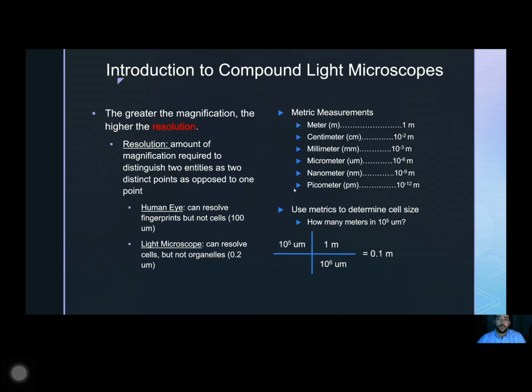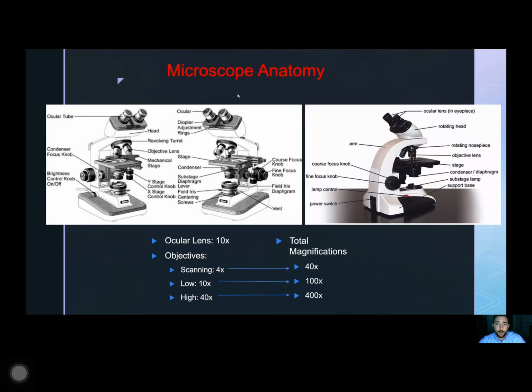And just a forewarning, on the practical, you will not have to do any math. So we're going to talk about some math, but we will not have to solve any equations or anything like that on the practical. This, however, you do need to know. You will want to look at all these pictures of the microscope and know all of the different parts, because that will 100% be on your practical. So make sure this picture off to the right is really, really good. So be able to label the microscope and know all of its different parts.